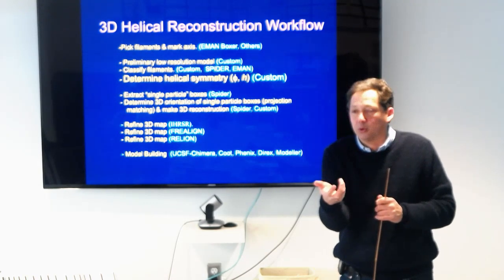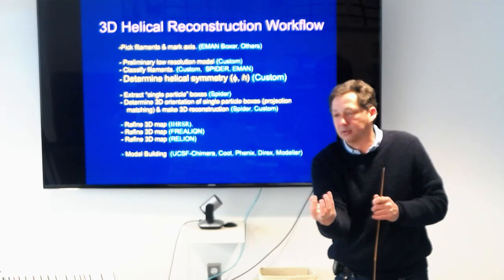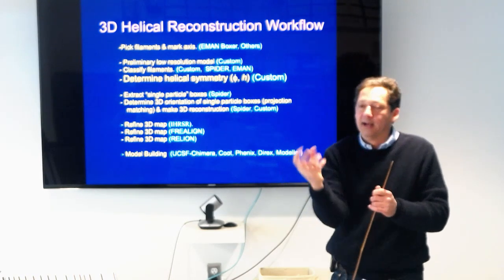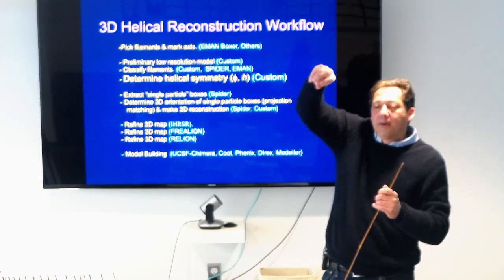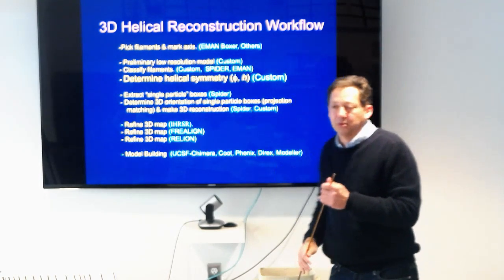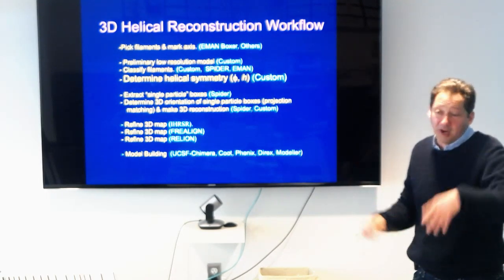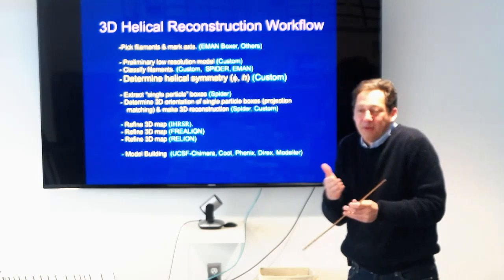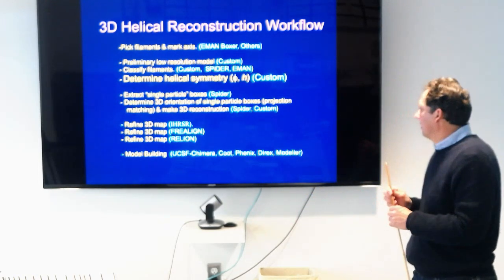Instead of being one tubulin, it is just the 13, let's say 13 tubulins that make a little lock washer, and then that repeats with the pitch of the microtubule. So you could adjust all that for any helix, depending on the problem.